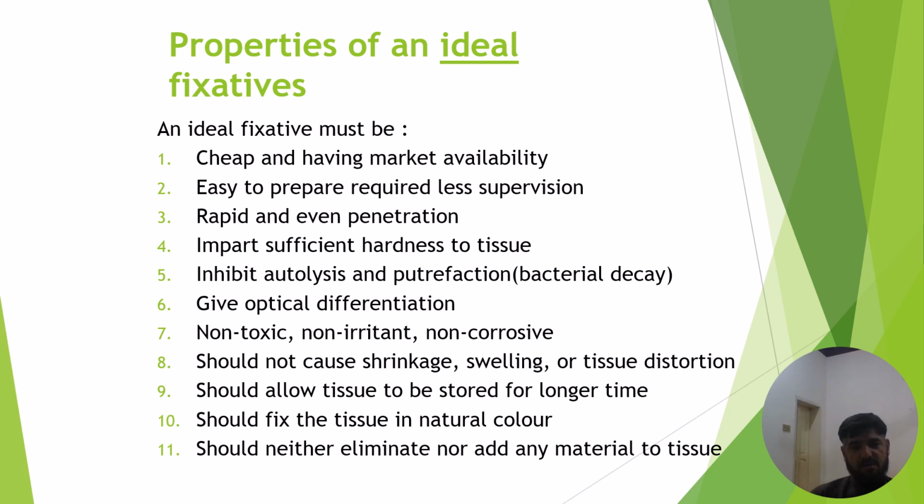It should not be toxic, irritant, or corrosive. It should not cause shrinkage, swelling, or tissue distortion. It should allow tissue to be stored for longer time, and it should fix the tissue in natural color or life-like manner. It should neither eliminate nor add any material to the tissue.